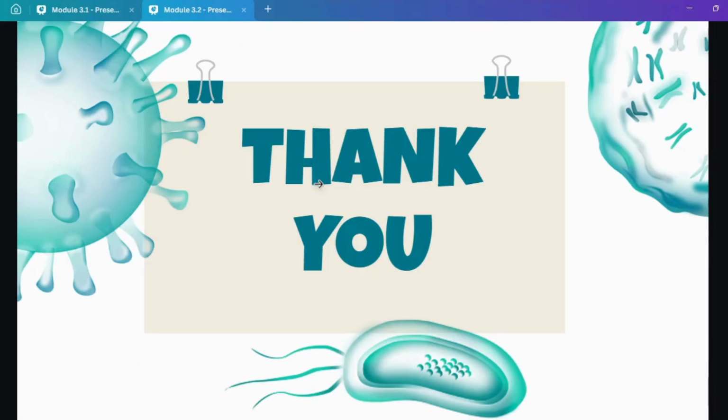Before closing this video, keep one thing in mind: your identity should be about 100% and your e-value should be about 0. If you are getting these, that means your results are significant, and you can use that match for further work.